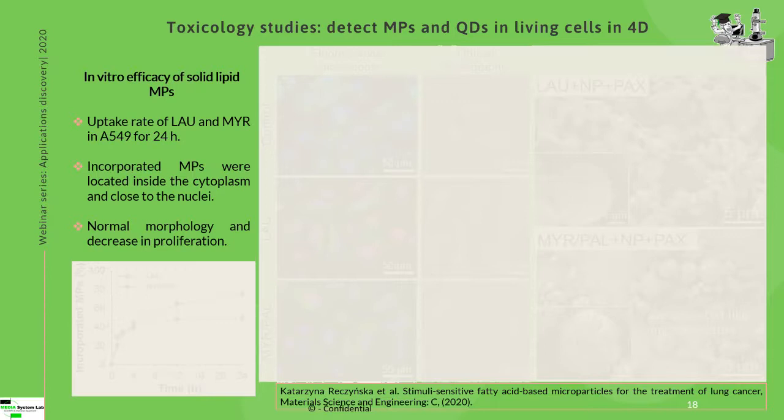If you check these microparticles with scanning electron microscopy, you can definitely see that the coating of these particles makes them quite different. In the bottom case, you have some delaminated-like microstructures. The microparticles are very porous, and there are also some filaments that interconnect them with each other.